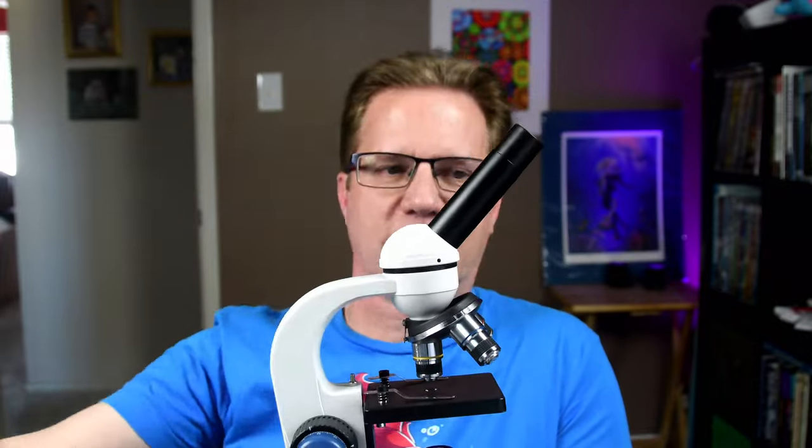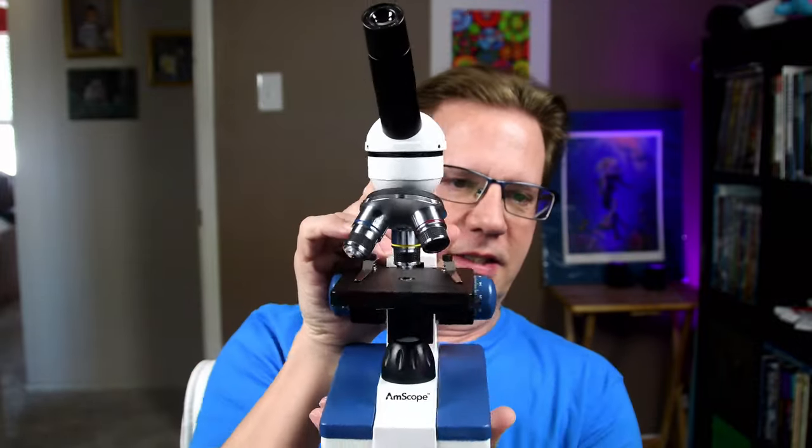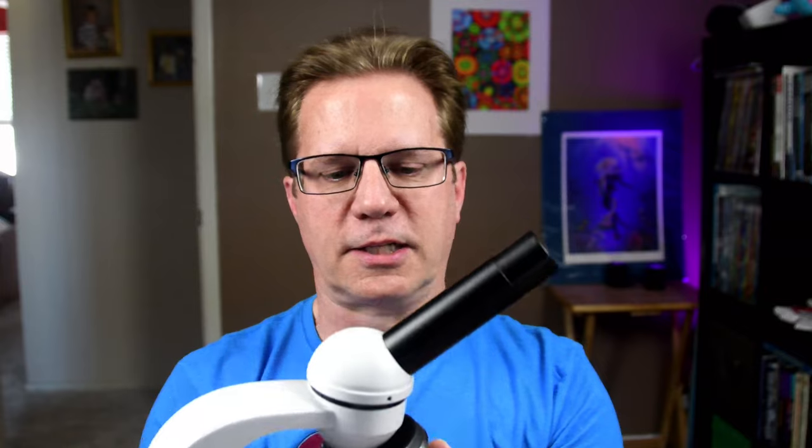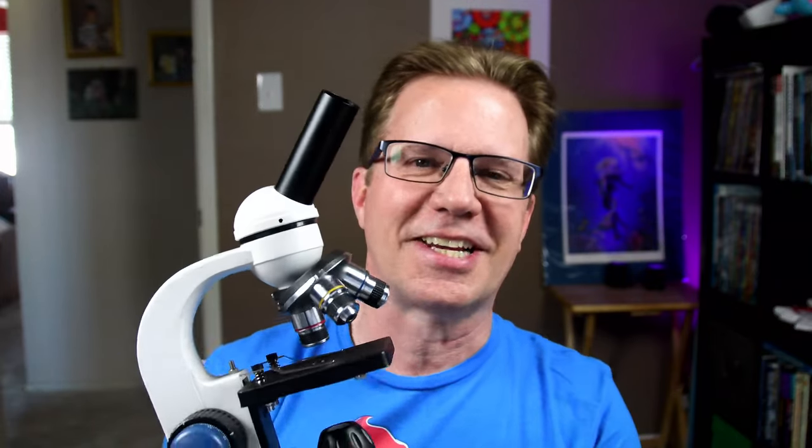This is my hobby-grade microscope, the AmScope 150C. You can move the optical piece for different angles, you've got three different magnifications, and it goes from 40x all the way to 1000x. There is an additional fitting where you could take out the optical piece. I haven't used one of these since high school and I'm sure the one I had in high school was better quality since it had to be durable and hold up with kids messing with it every single day.